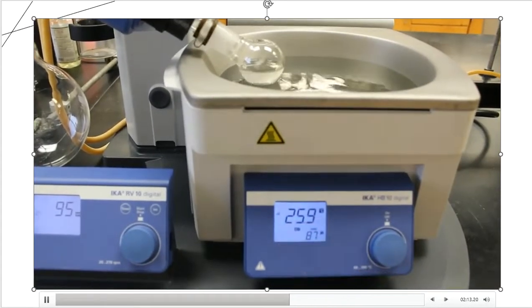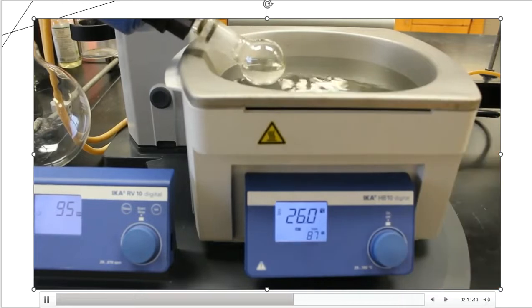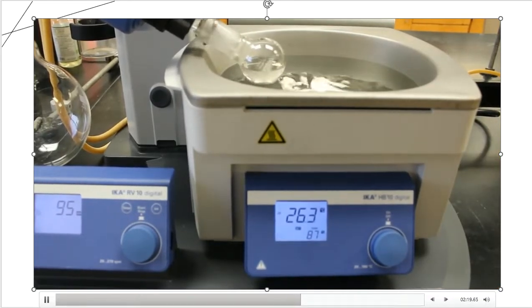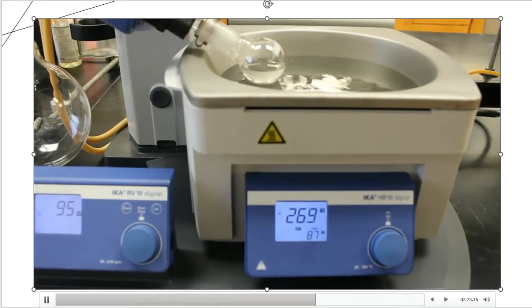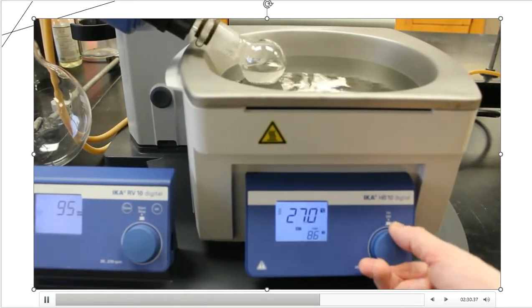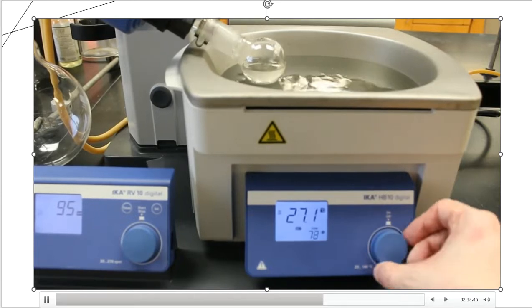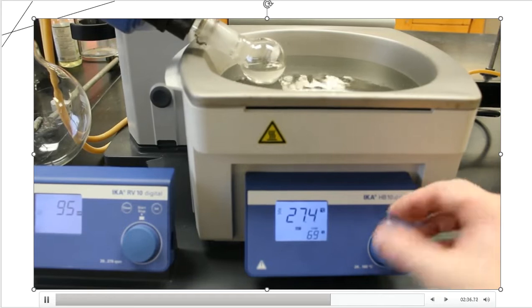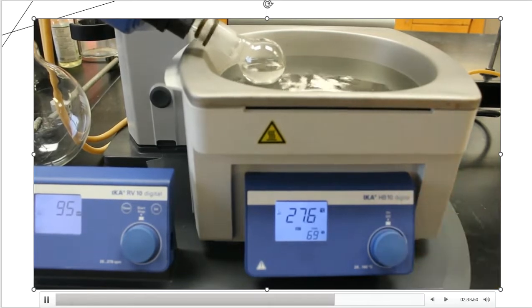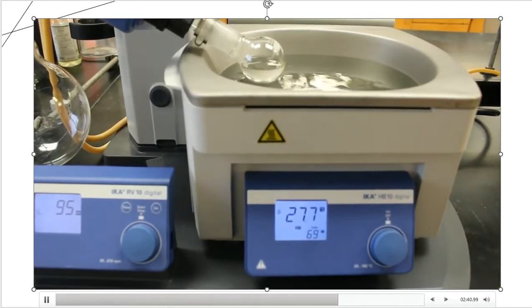This is the temperature right now of the water in the water bath, at 26 degrees. You can see it's heating up. Not fast, but it's not slow either. It will be there in a few minutes. And I've set this at 87 degrees, so I can lower that down if I want to. Actually, I probably can already. I know methylene chloride is not going to take a lot of heat in order to go somewhere, so I'm just going to stop that at 69 degrees.